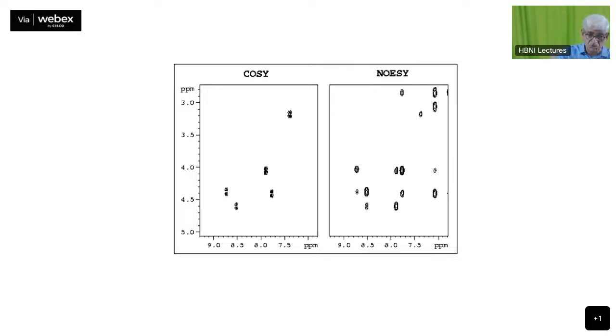For the same portion of the same peptide, you will see these 5 things which were present there, and you are seeing correlations to the next C alpha. This is the NH, backbone NH, and this is the C alpha H. Okay, and for NH, you see 2 peaks there. Why do we see 2 peaks? One is the same peak which is present for the individual amino acid residue, but you will see another peak. This actually belongs to another residue which is on the left side. So if I say I minus 1, I residues.